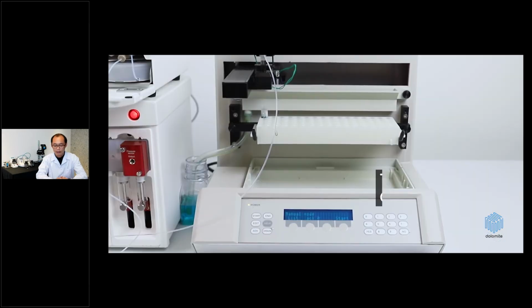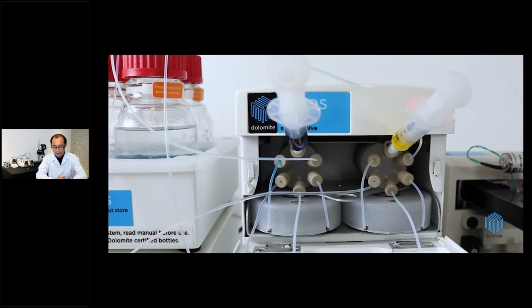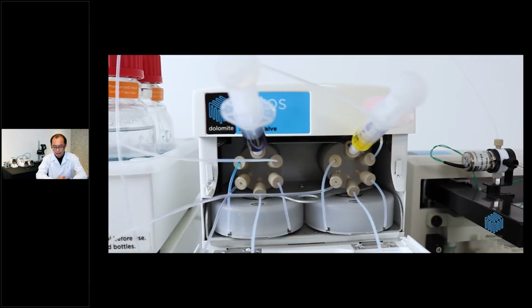finally the automated collector. When running your protocol, the Flow Control Center software prompts you to load your nanoparticle precursors. Samples are loaded here at the ASV via two different syringes that fit into the luer fittings on the front of the valves. During a run, the ASV releases the defined volume of your nanoparticle precursor from each loop to converge in the microfluidic chip. Once the two fluids have converged, a downstream T-junction chip allows further optional dilution of your sample.